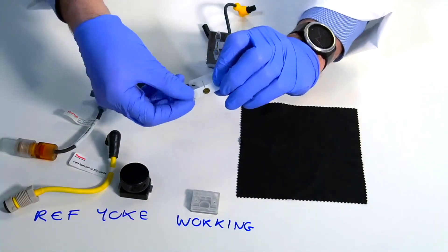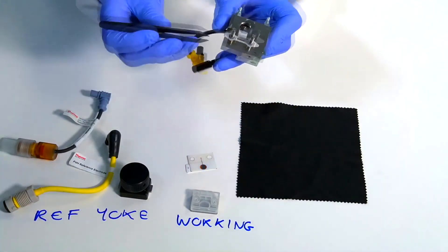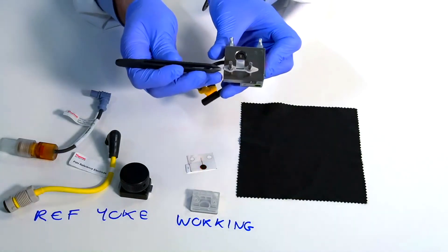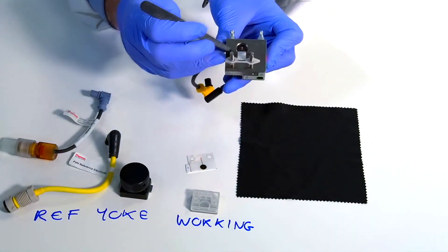In between the working electrode and the cell body we have a gasket. This gasket is what forms the actual cell volume itself, and you can kind of see the little slot there. That's where the sample flows.